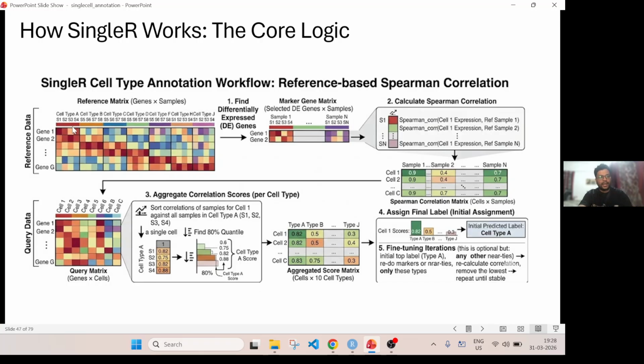Now you are reiterating it. So instead of that, now you are just taking this many data set, and because of that your differential expression gene will change, because earlier in the first iteration your differential gene expression of cell type A was against cell type A versus everything together, right? So now the differential expression will change between A and B. I think you got the point.